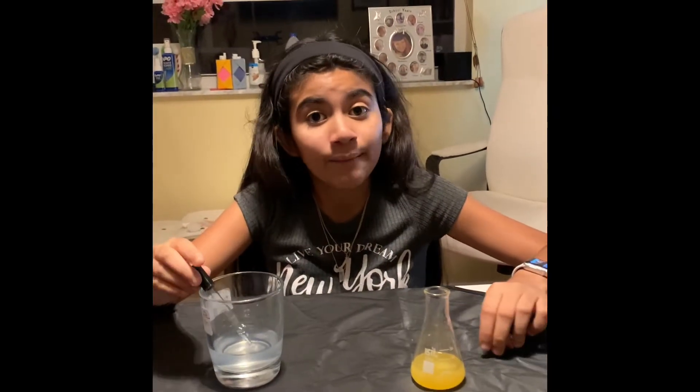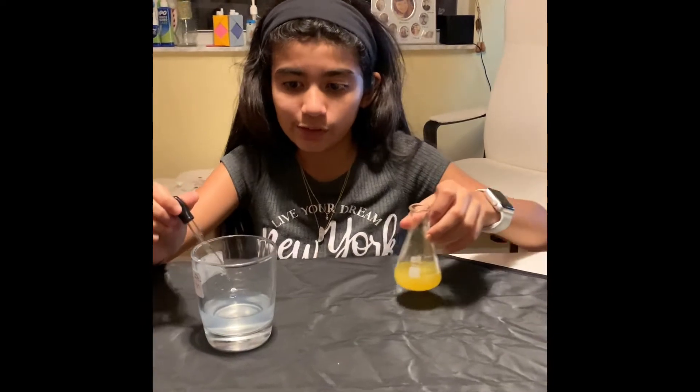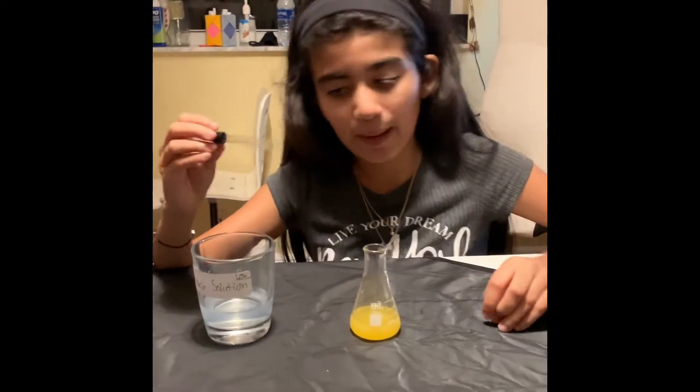Hello, so now I am going to show you the process of titration with freshly squeezed orange juice. I have 20 milliliters of this juice, which I will now add starch solution to. I will add 10 drops with this pipette.